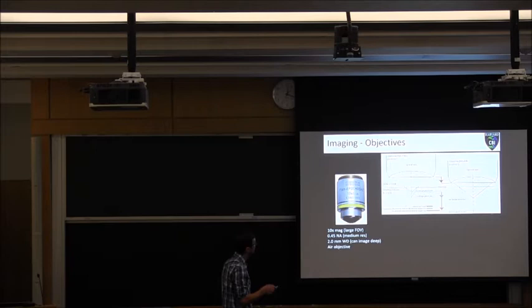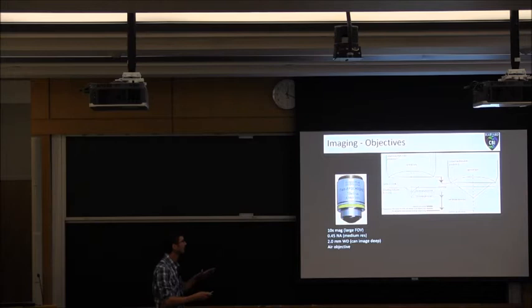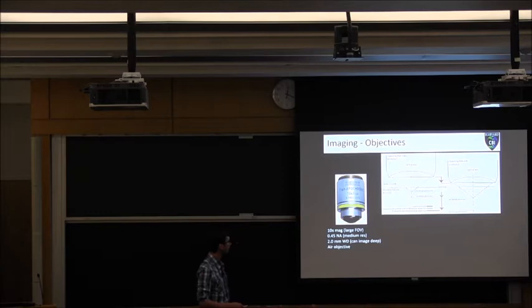But because we don't have oil here, we have air, we have that refraction, here's where our focal plane actually ends up. So what that means is we've only moved our objective this far. The microscope software thinks we've only moved that far. But our focal plane inside the sample has actually moved the distance of this orange arrow. So that means we've actually moved twice as far in the sample as we've moved our objective. Right? Here's the big problem with that.